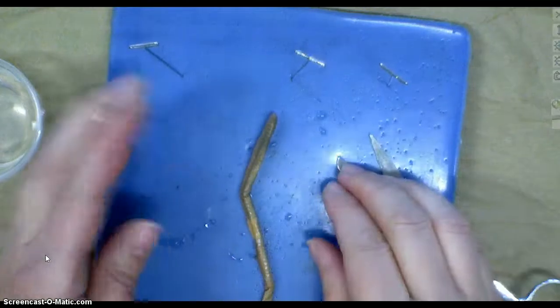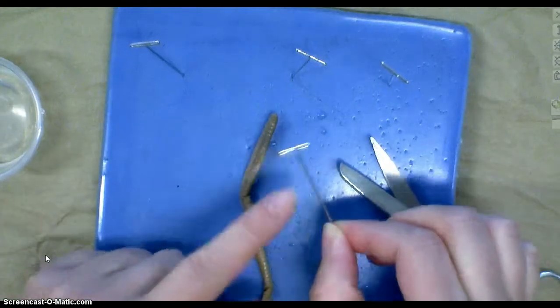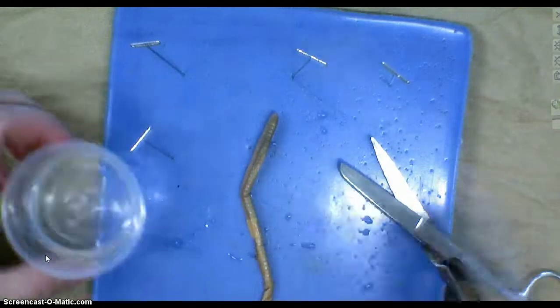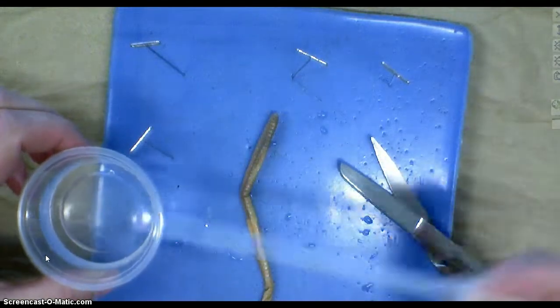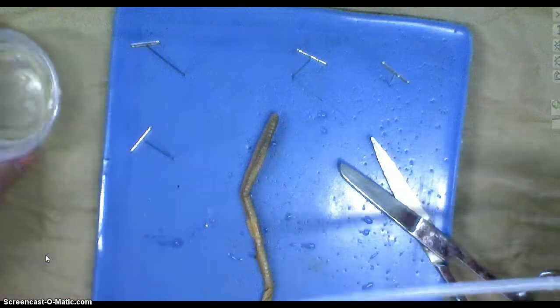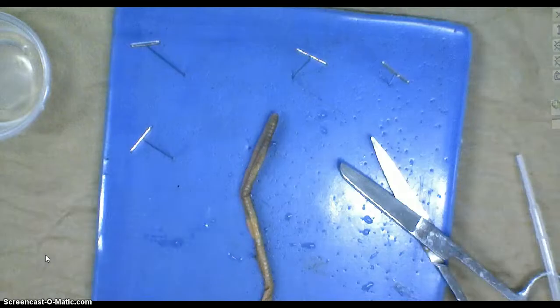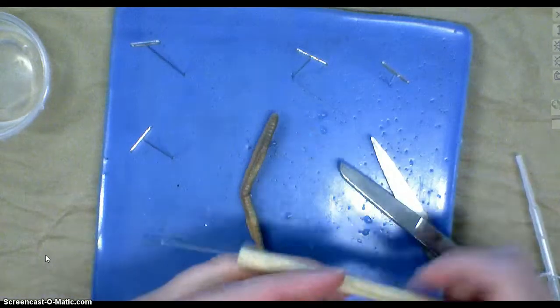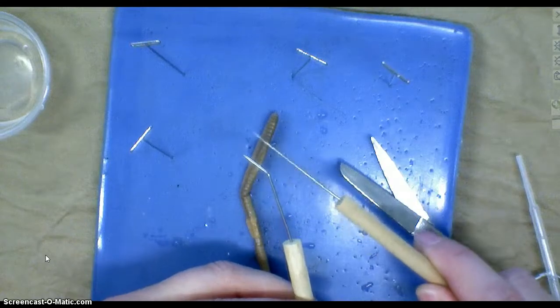Other things that we'll use will be these T-pins. You can see why they're called a T. We will use water because as the organism dries out, it will evaporate very quickly and it makes it easier to tear. We will also use probes. We have pointy ones, they're all pointy I guess, but this one's bent and this one's straight.